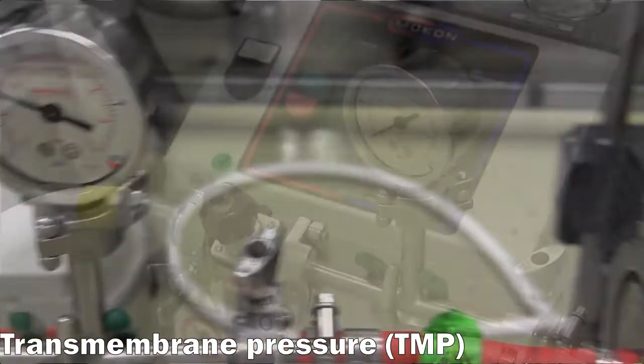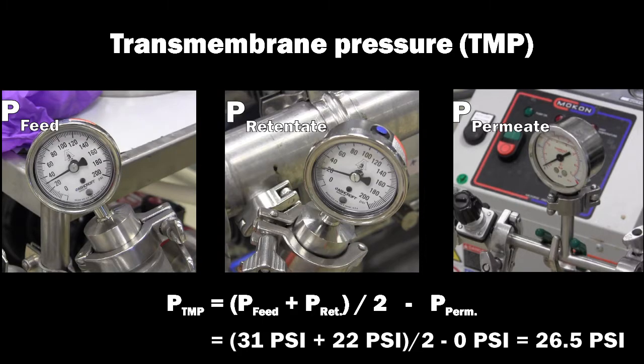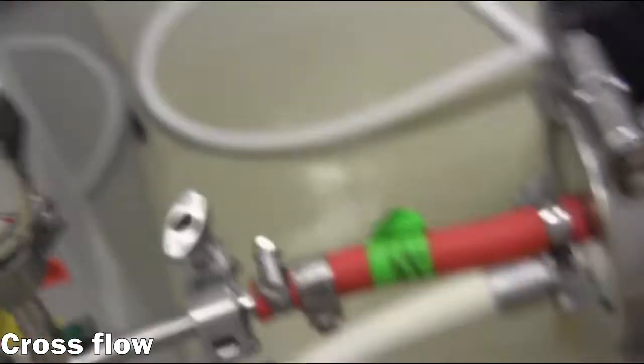In this example, the permeate outlet is measured at 0 psi gauge, which along with the other pressure readings, results in a transmembrane pressure of 26.5 psi gauge. Lastly, the cross flow is about 20 liters per minute.